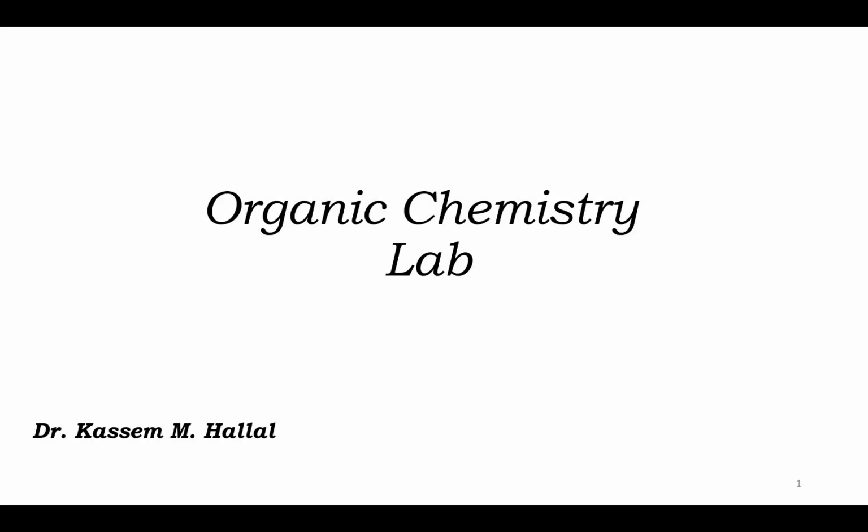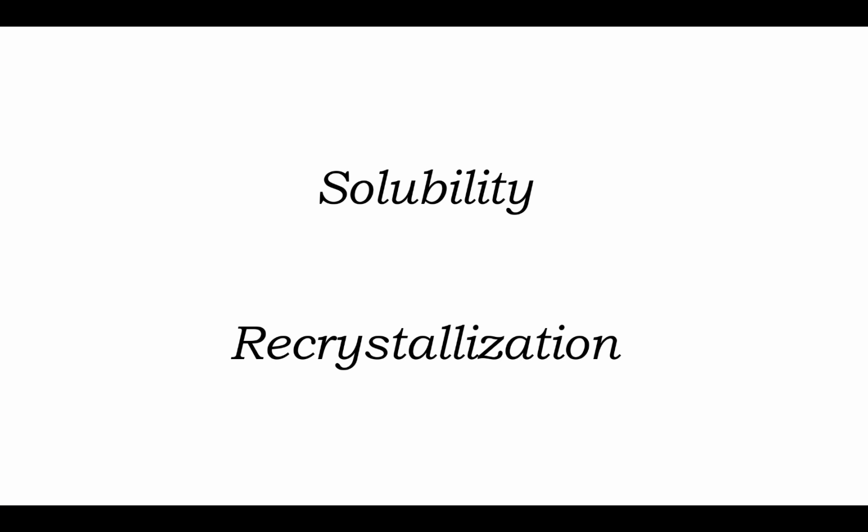Hi, in this video I will talk about solubility and its effect on recrystallization, which is one of the most important techniques that we usually use in an organic chemistry lab to purify solids.